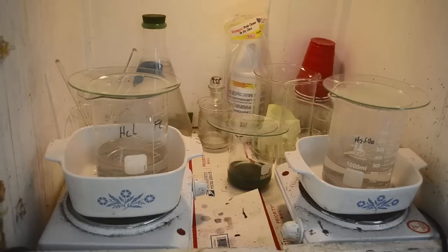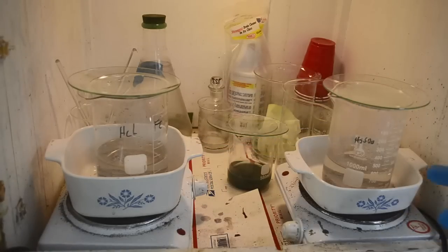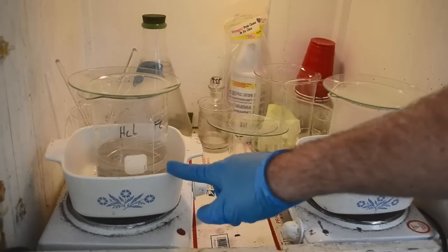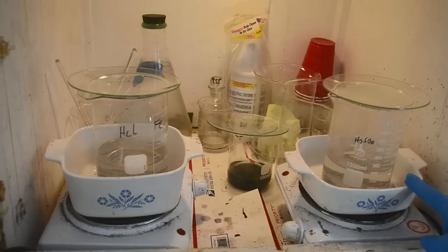So, how much acid do I want to put in? I'm thinking fairly dilute. So I'm going to put about 100 milliliters of hydrochloric acid in there. And then for this, at the most about 50 milliliters of sulfuric acid. All right, so this is going to give me about a 20% acid solution over here, and about 10% over here.